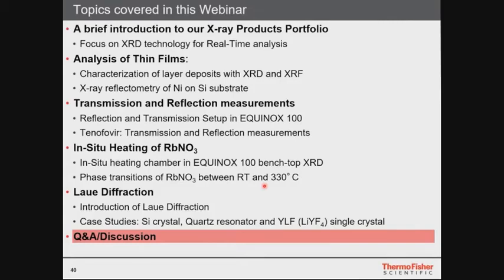As far as I know, there are some norms which apply for asbestos in the cosmetic industry. I am not very familiar with these norms, but in principle, asbestos is a crystalline material, a silicate, and it will give some signals, which could then be quantified.